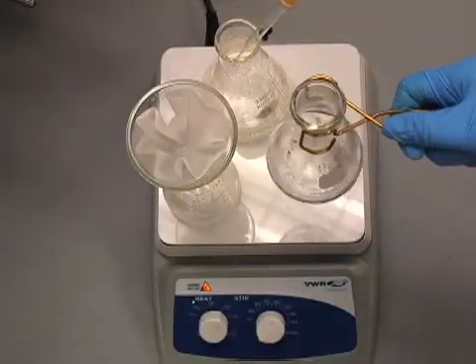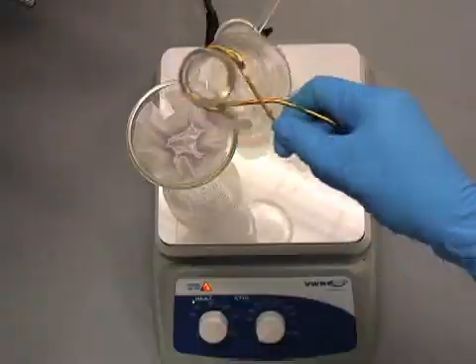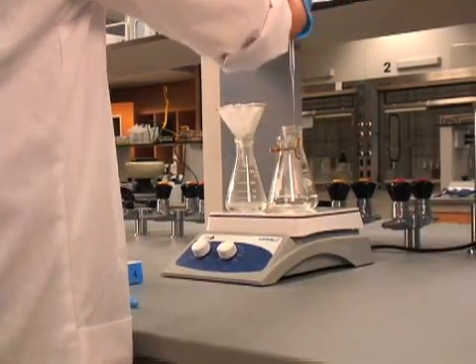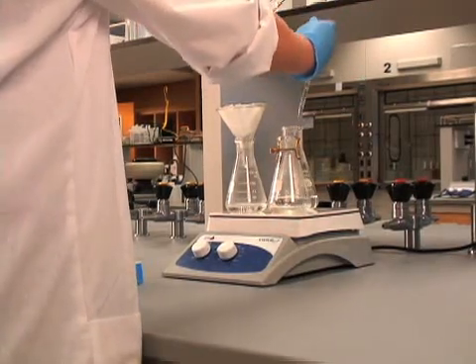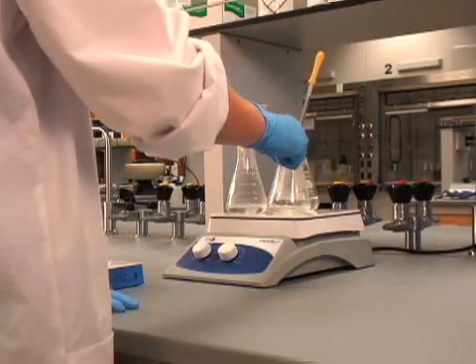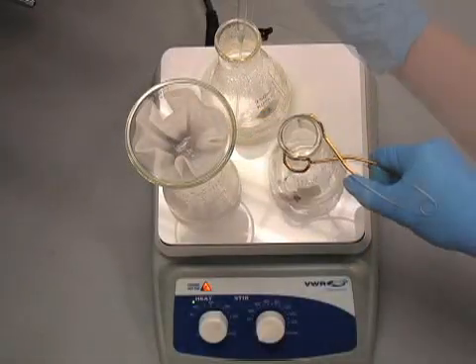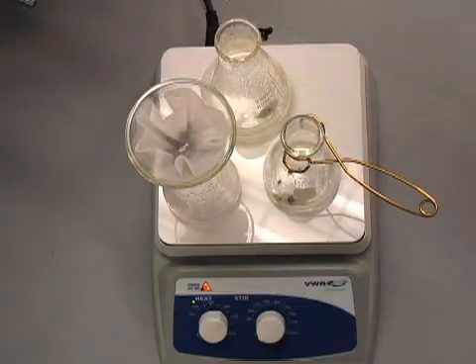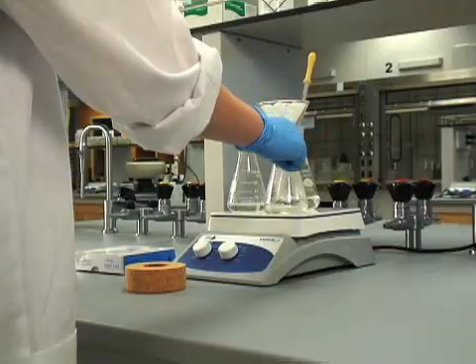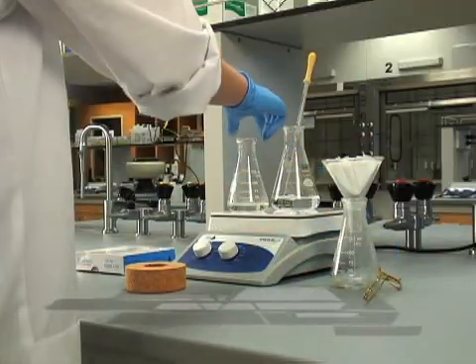Now we're ready to filter our solution. Wash the flask with a small amount of hot solvent to help remove any remaining compound. Rinse the filter paper one more time to wash any solution trapped in the filter, and then set it to the side. At this point, we've successfully separated the insoluble impurities.